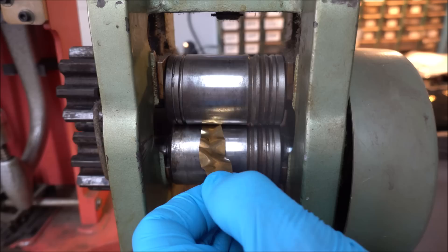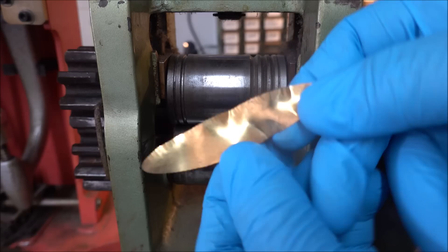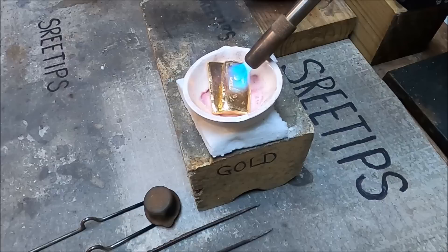I begin the process by rolling out a 4 nines fine pure gold coin Canadian maple leaf to just a few thousandths of an inch thick.